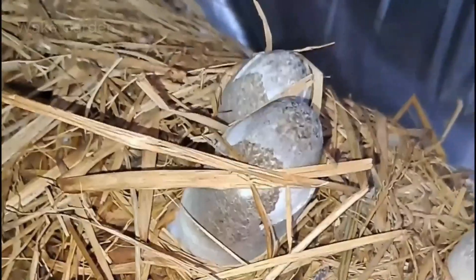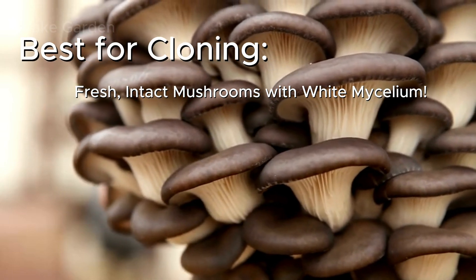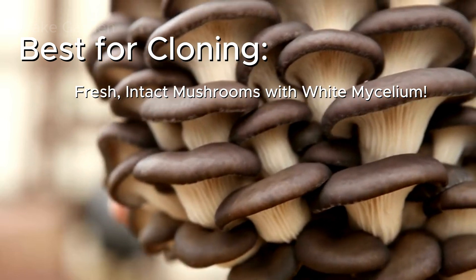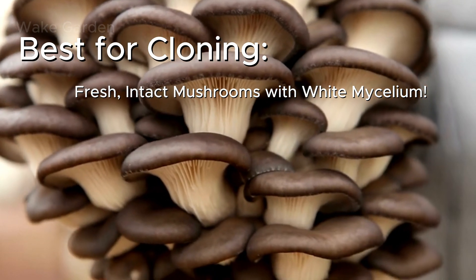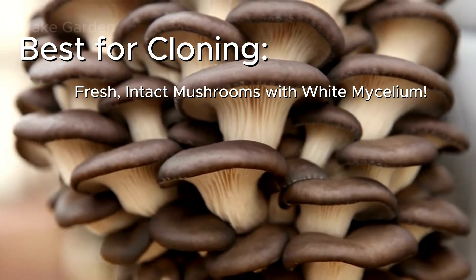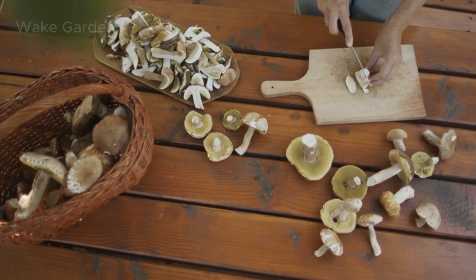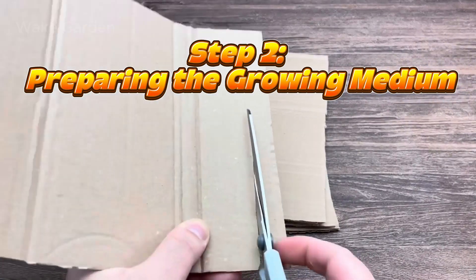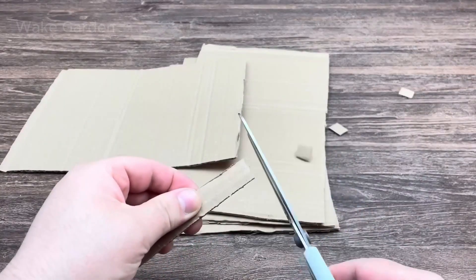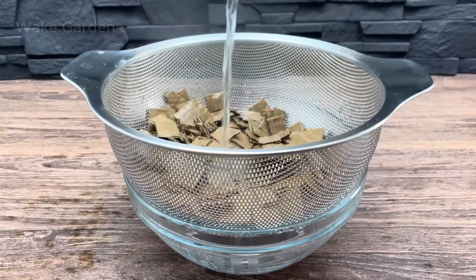To start, make sure you choose fresh mushrooms with intact stems. Look for mushrooms that have a white fuzzy layer of mycelium at the base — this means they are still alive and ready to grow. Avoid mushrooms with dry, cracked, or cut-off stems, as they won't clone successfully.